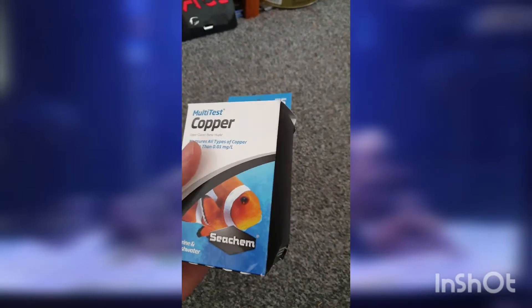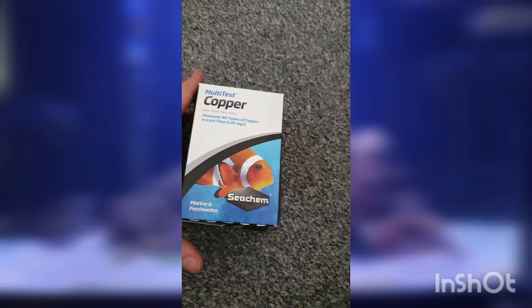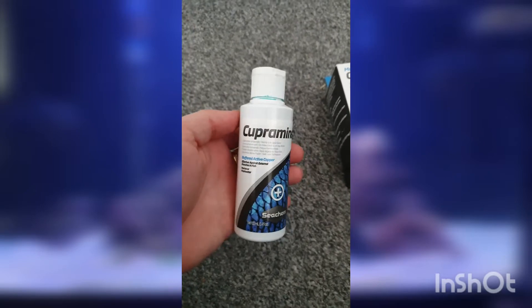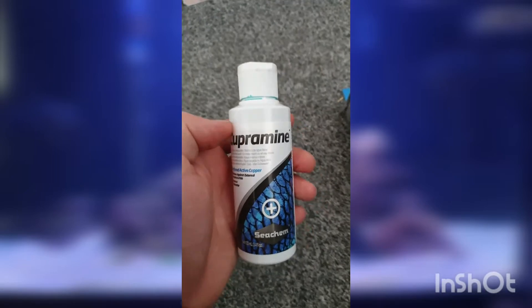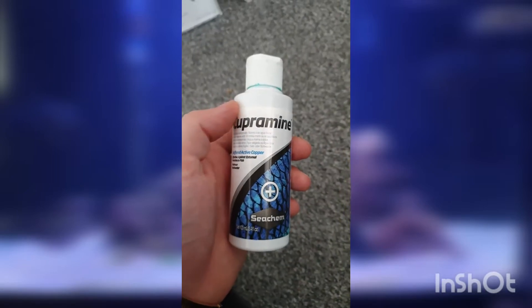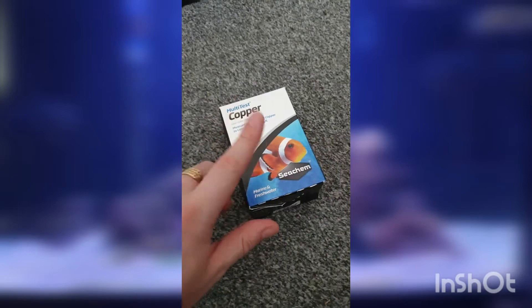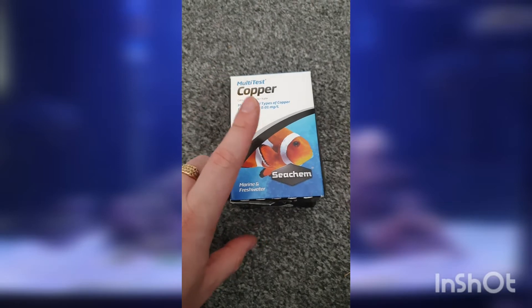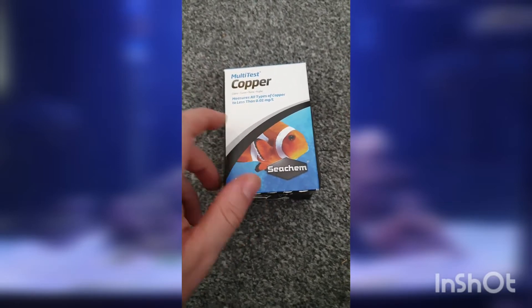Welcome back everybody. If you've just come to this video from the last one, we are doing multi-test copper. As you've seen in the last video, we've been dosing Cupramine in our hospital tank. We've just done our second dose and now 48 hours later from when we initially started, we are going to do a test to see where our levels are at and I'm going to show you how to do this test, look at the results together and go from there.